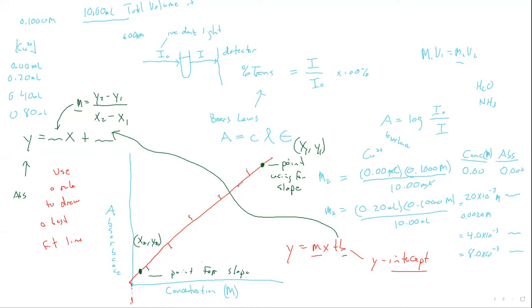And so you could draw a circle, right? You might say, all right, this point's good, that point's good, the low concentration points should be good. And then you might say, oh, this point here, I think this is where we're going to have a deviation from Beer's law. When we get to this concentration, there's kind of a deviation from linearity.